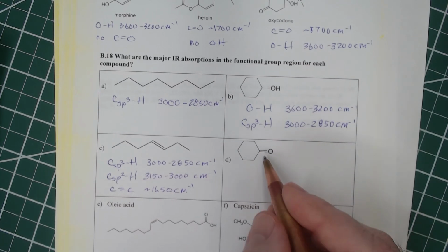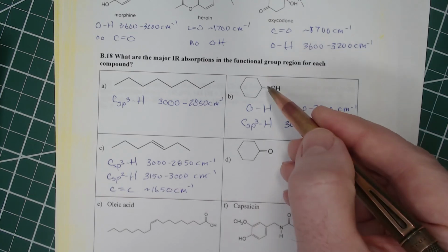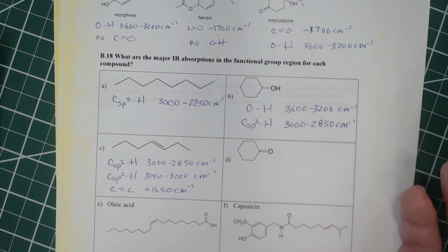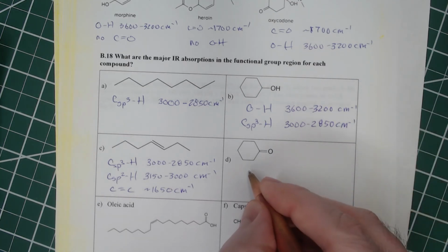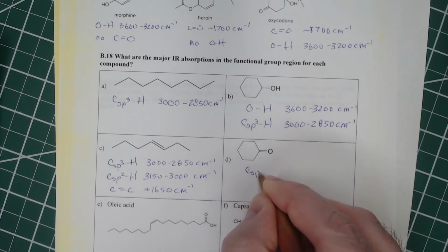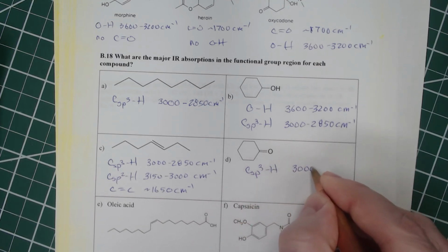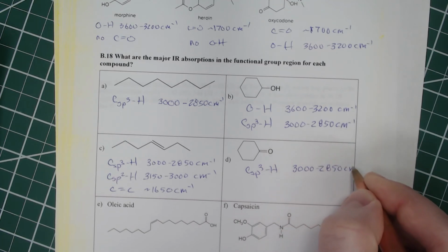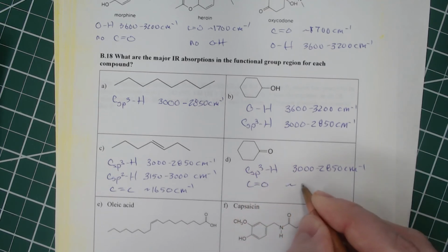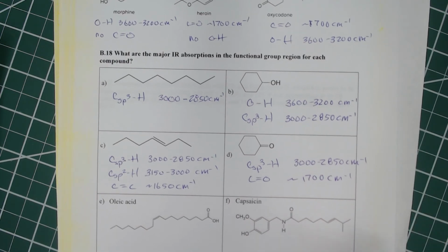All right, here we've got cyclohexanone, and there is an experiment where we take cyclohexanol and convert it into cyclohexanone, which we do in lab, and IR is one of the ways we determine if we've done that experiment correctly. So here again, it is going to have the sp3 hybridized carbon, and it'll be 3,000 to 2,850. And then that carbonyl should be very distinctive at about 1,700 reciprocal centimeters. It should be pretty strong.